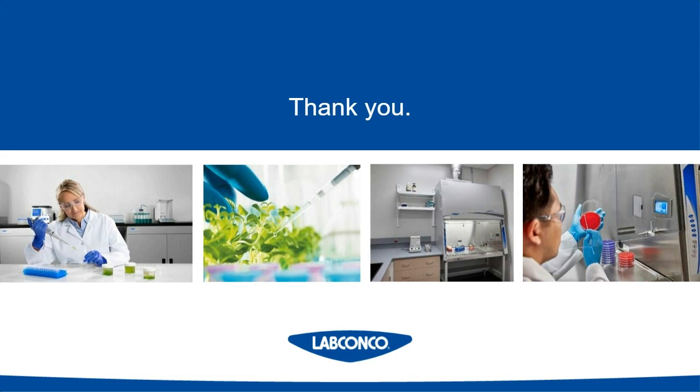If we don't receive any more, our last question here is, what kind of enclosure would you recommend for automation equipment? That's a great question, and one that we get more and more often these days. Traditional biosafety cabinets are designed around a user sitting and working, usually doing their cell culture or something like that. Now, when it comes to automated equipment, this could be a liquid handler or something that's pipetting liquids into plates for you or things like that.